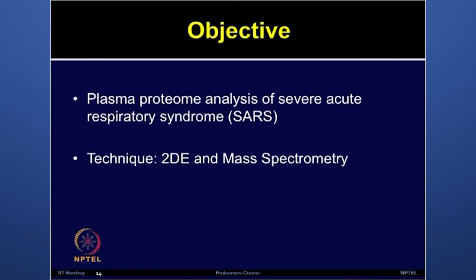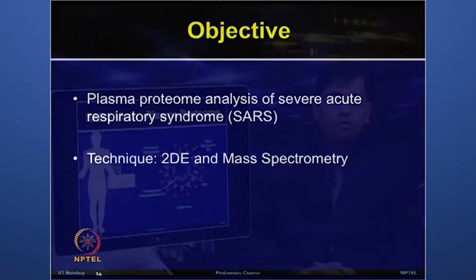In this study, authors employed conventional two-dimensional electrophoresis, analyzed those images from the treatment with the controls and identified the differentially expressed proteins by using mass spectrometry techniques including MALDI-TOF and LC-MS/MS. Finally, the interesting identified proteins were validated by techniques such as Western blots.